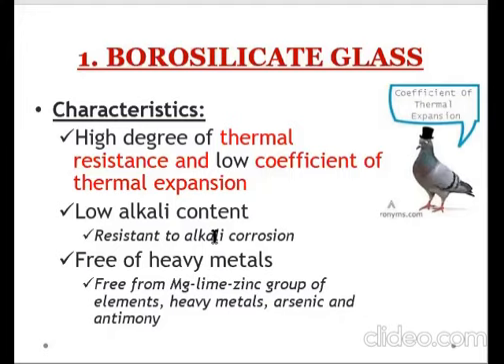And because of this low coefficient of thermal expansion, this is the reason why it allows manufacturing of heavy walls. What do we mean when we say heavy walls here? When we say heavy walls, yung mga glass na makakapal na masyado, okay? Yun yung dinedescribe ko ngayon na heavy walls. Diba? Kasi for example, may mga bottles na napapansin nyo, makapal masyado na siya. Parang maraming layers. So, yun yung nire-refer ko na heavy walls.